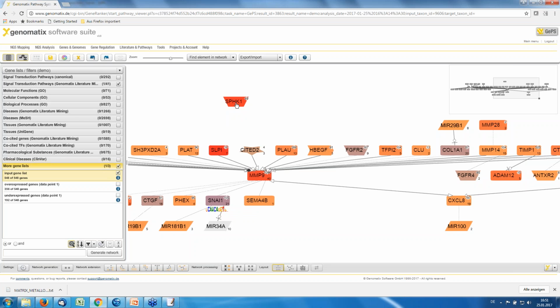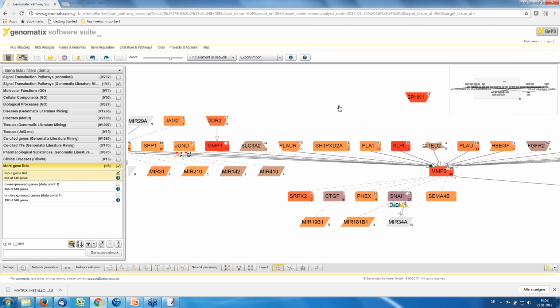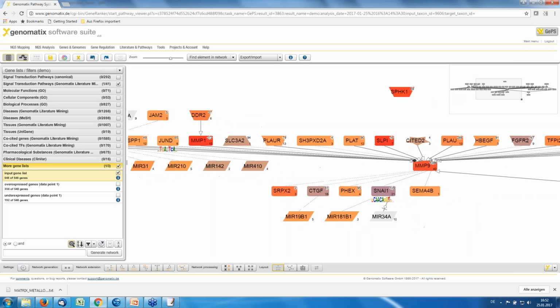And the kinase will be added, as it is also in our regulated list. It's upregulated because it's the transgene in the experimental data set. We get a red color, and we can include it in the network here.